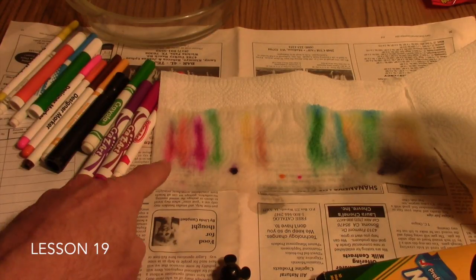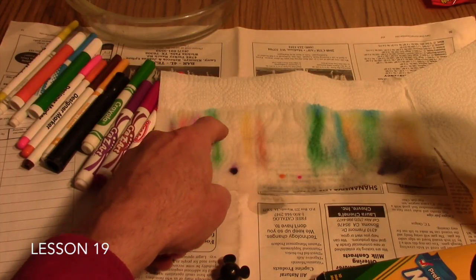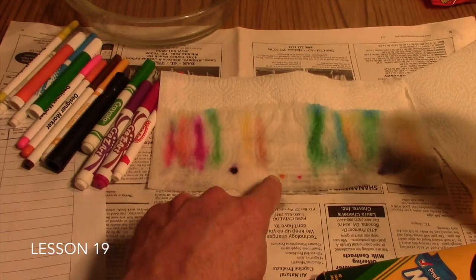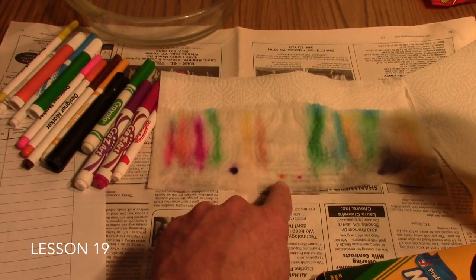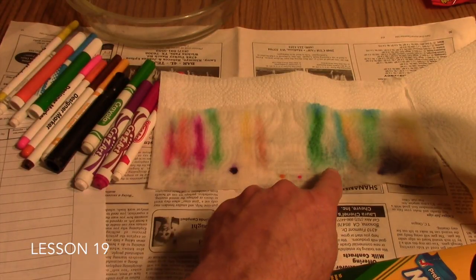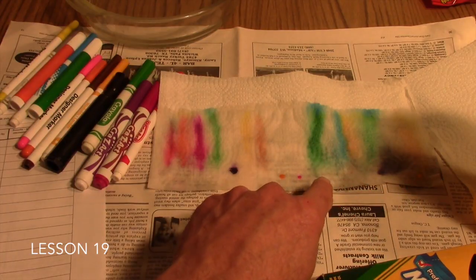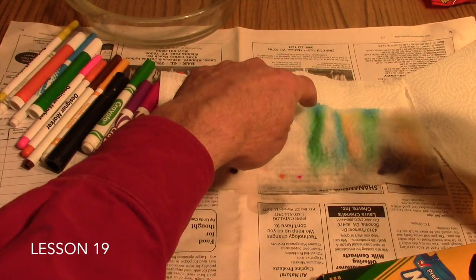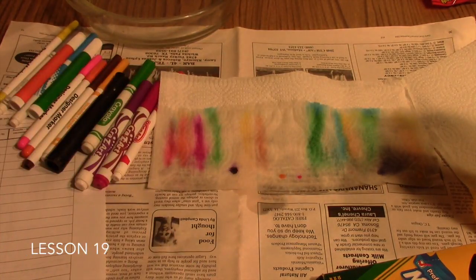So here we can see we definitely had inks that were soluble in water. This ink here was partially soluble. These appear to be totally insoluble. In other words, the water did not do anything to separate the inks. And then again, a series of very water-soluble inks over here. And again, we can see our front is actually still right across here and is maybe moving some still.